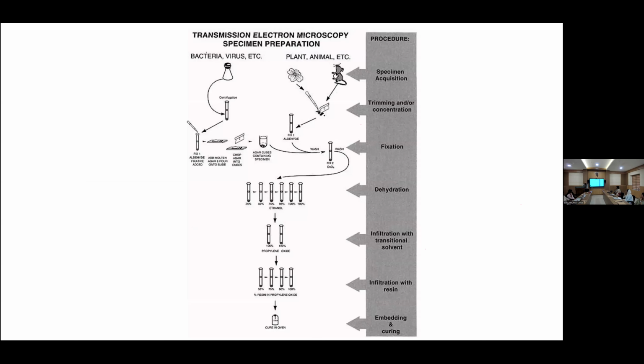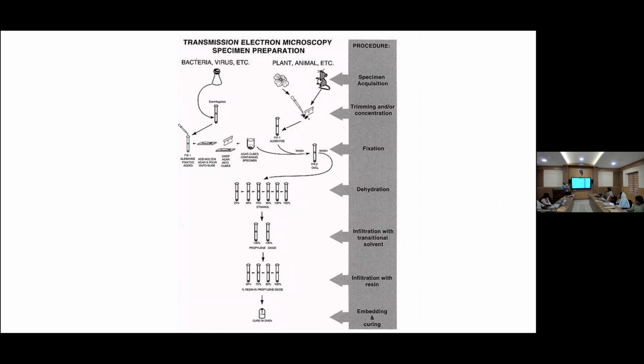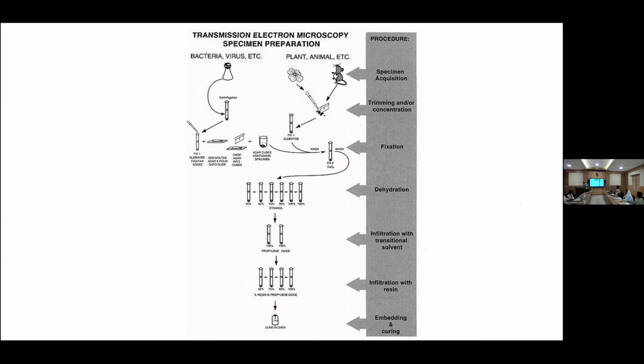So this is the sample preparation method for biological samples like tissue samples or plant samples. This is not very easy, because if you want to analyze your cells or tissues, first we should remove them from the organisms or from the animal. The next moment it starts to degrade. So whenever we collect or dissect the sample, the next moment you should transfer it to a buffer solution for fixing, because we want to keep it intact. Then we should remove all the water content, because living cells have more than 50% water content.